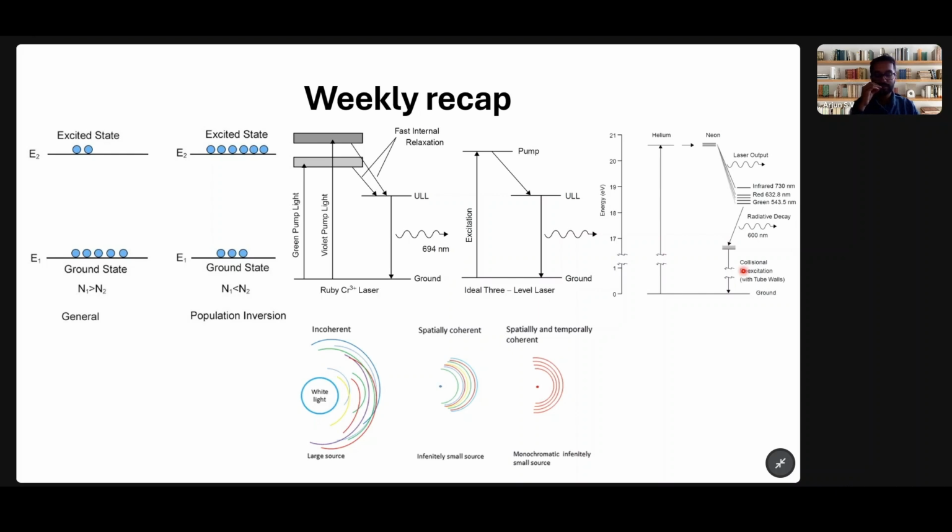But on the other hand, spectral brightness is used to judge the power of a laser. Sorry, spectral brightness is a property used to adjudge the power of the laser with respect to the region in which it emits. So it's basically a measure of the power of the laser with respect to the excitation wavelength. So it has units of around watt per nanometer.